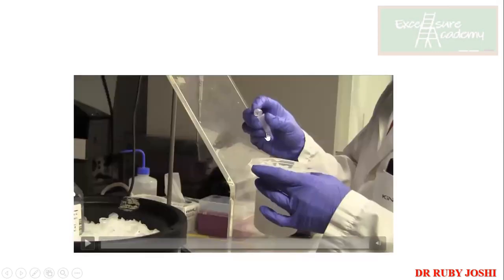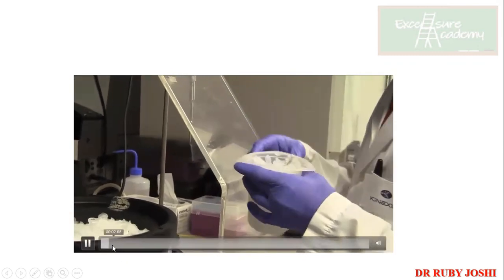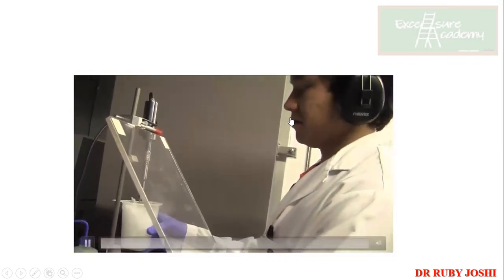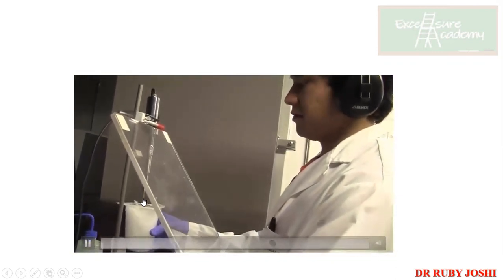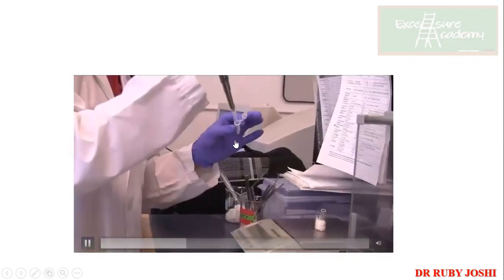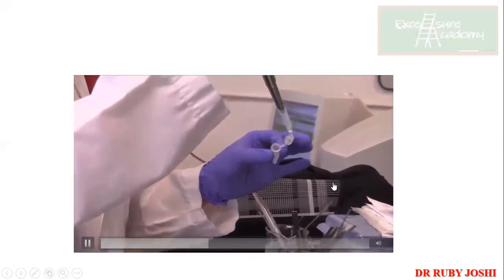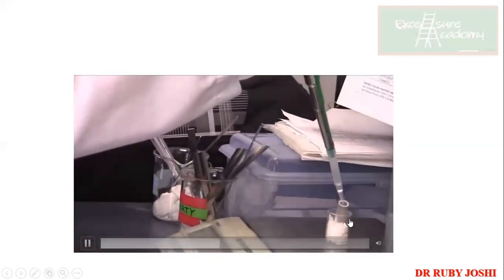So this is just a video where you can see how this person is doing it. Okay, can you see it? These are the eppendorfs in which the cell suspension is kept. There is no volume to this. Okay, so the shield is there. You also get ear cuffs so that the noise doesn't get into your ears and damage them. So ice here, and this is the probe you have inserted into this. Now, after this is done, you take it into a centrifuge vial. Okay, centrifuge vial we say.